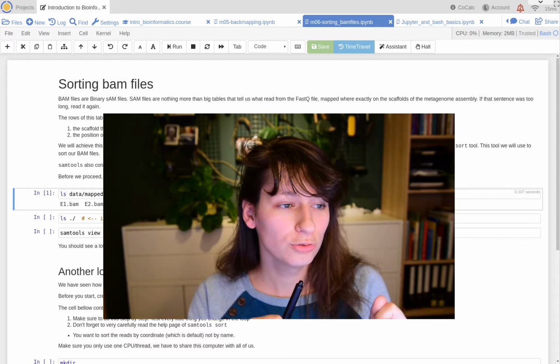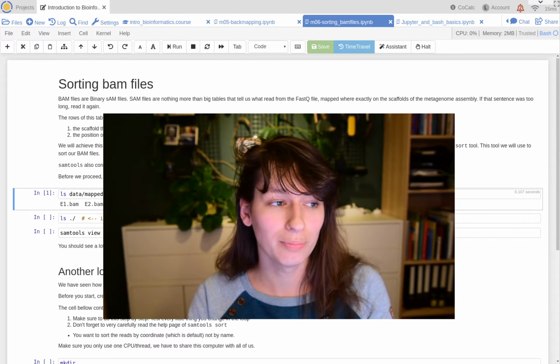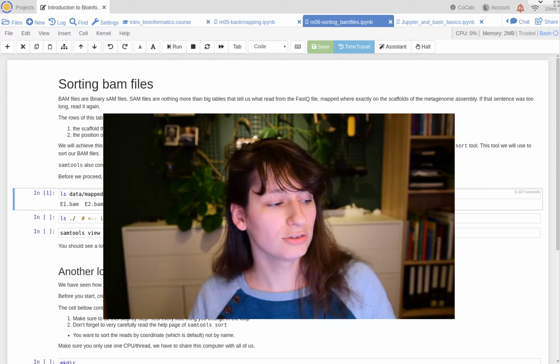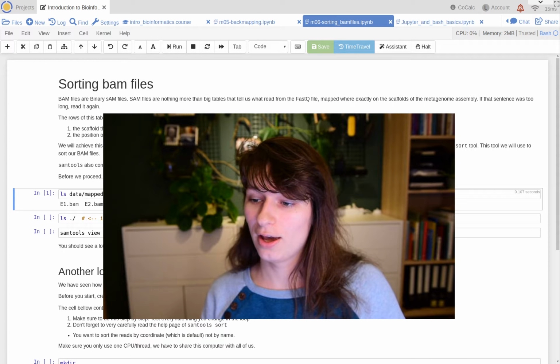So you should have by now finished the back mapping step. Perhaps you are still running that step, so BWA mem and samtools are still mapping and storing the reads in bam files. A good idea is to at least check if that's going okay and if it's finished.